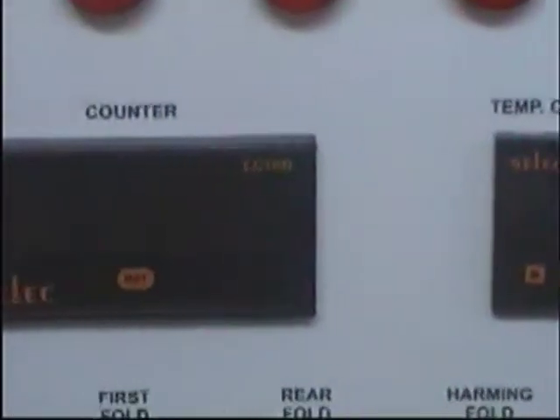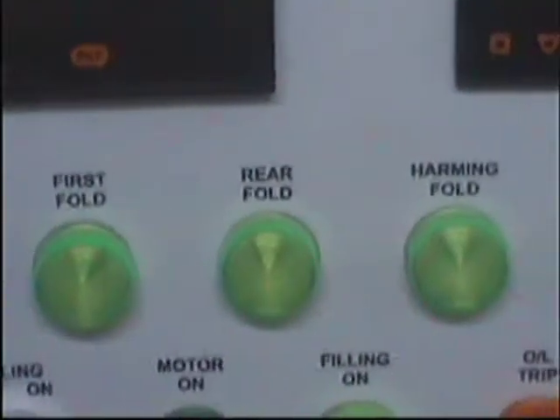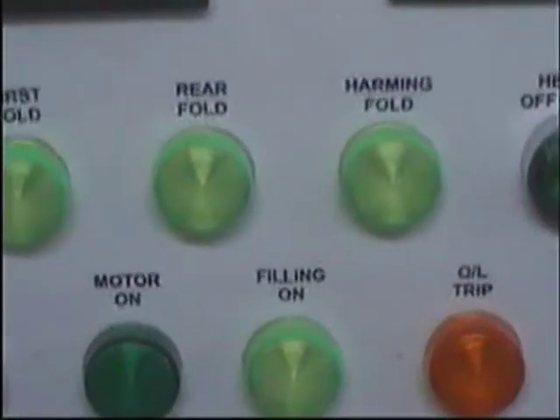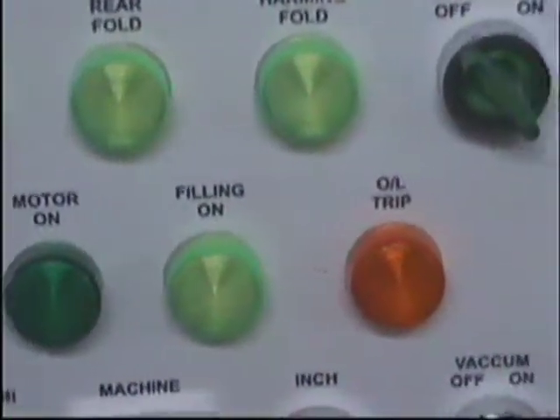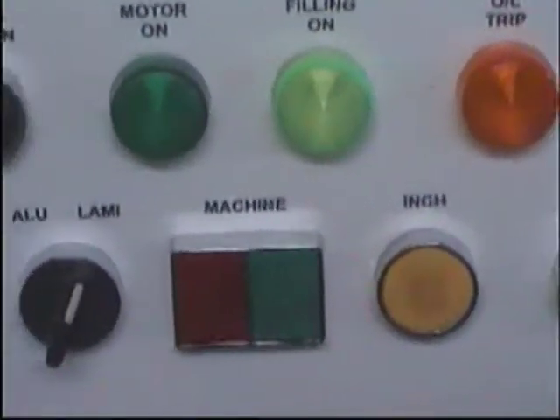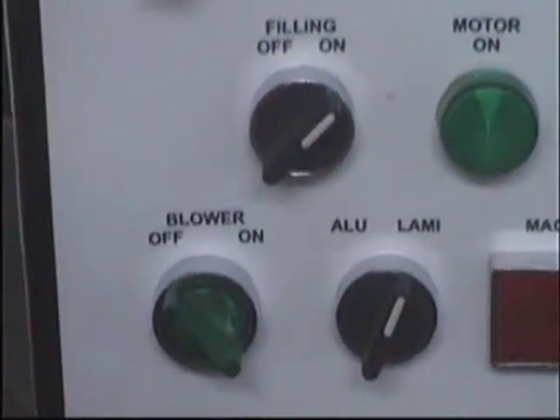On the control panel you can see the temperature controller, RPM counter, counter on/off, first fold, rear fold, hammering fold, heater on/off, filling on/off, motor on, filling on, overload trip, vacuum on/off, inching, start/stop button, aluminium/lami selection, and blower on/off.